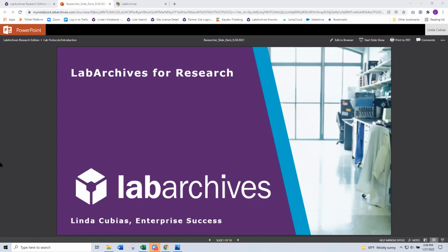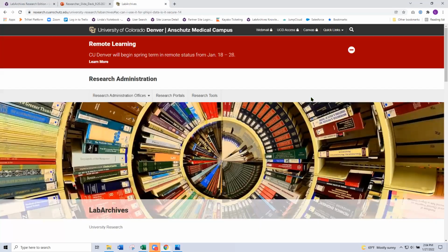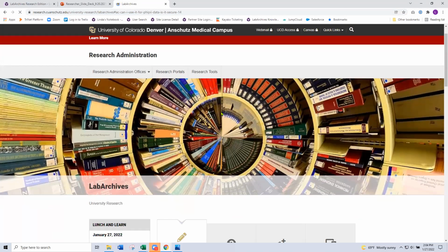Before I jump into the PowerPoint, I do just want to point out your local page that's been created here, and you'll see it available to you under the Research Administration page. I can share the direct URL with you momentarily. You'll notice I was clicking on some FAQs, so someone adjusted that URL there for you.